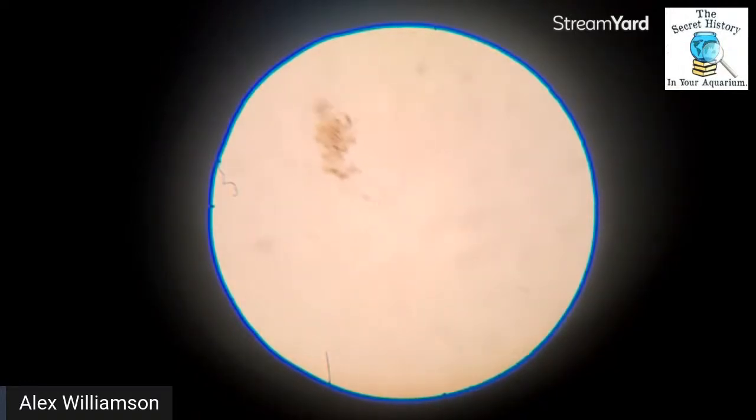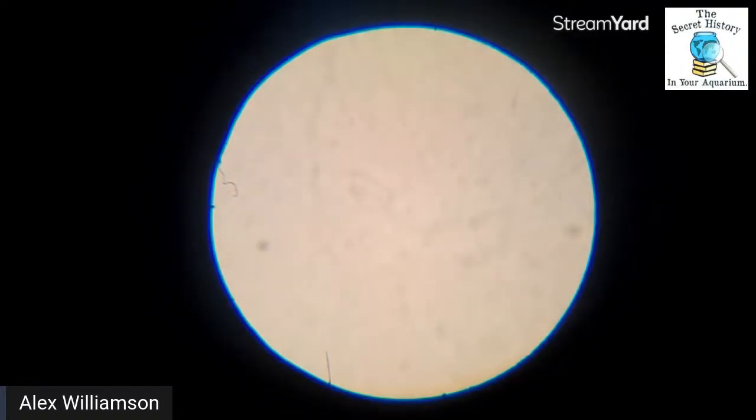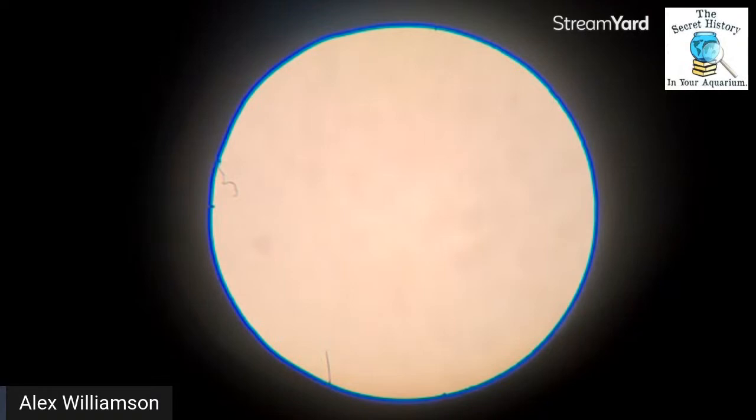So I wanted to just show you guys some basics. This looks like clear water, and it's not. There is all sorts of little life forms. Let's try 400 times magnification. We'll see. Usually this one doesn't work so well with the phone, or with the attachment to the phone, rather. And as per usual, it's not working. Okay. That's a bummer. I do need to get a new lens. It's got a problem for some reason.